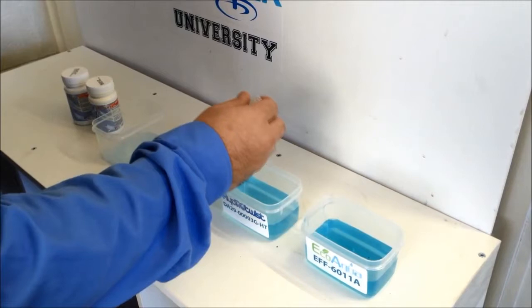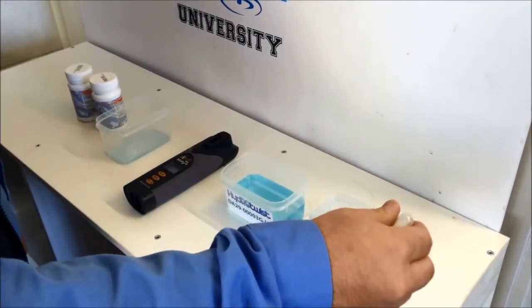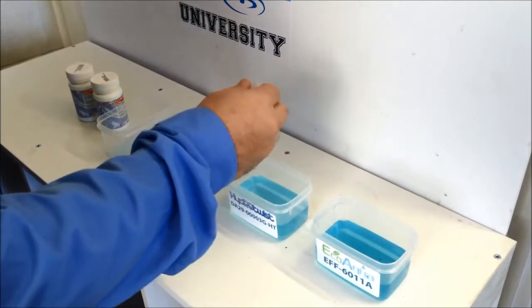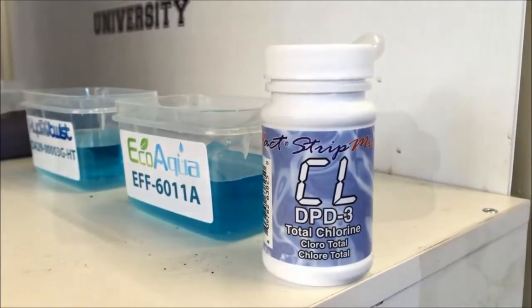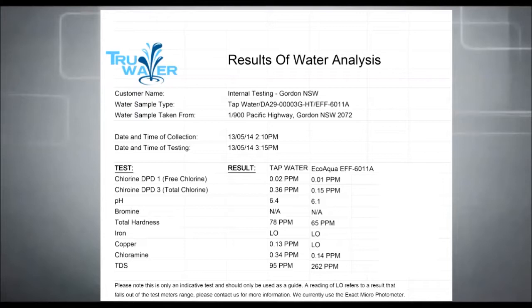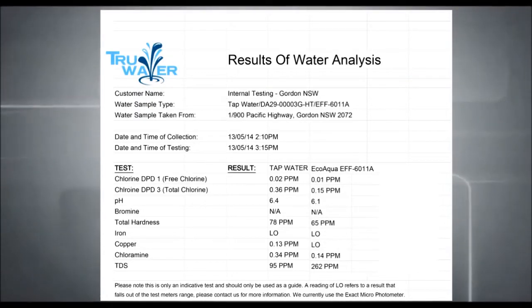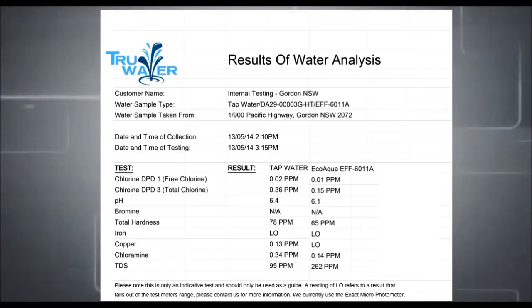In this test we use a combination of the following: DPD/1 free chlorine and DPD/3 total chlorine. This gives a reading of 0.15 parts per million. This readout shows that the filter has taken around 55% of the chlorine from the tap water.